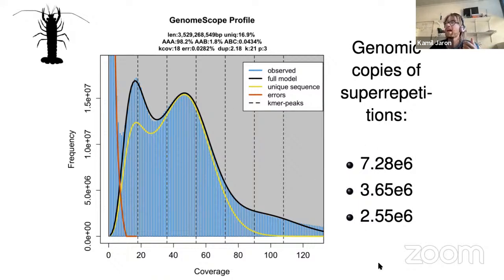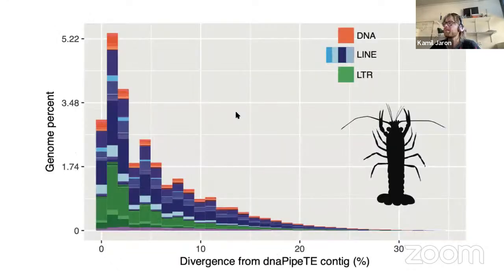And if I fix that, if I actually say I would like to count all the k-mers up to a few million copies, it actually did estimate the genome size exactly as I expected. So it's basically just capturing the real repetitiveness of the genome. We actually played a bit with it, and there was a recent expansion of transposons that seems to play a role in this.